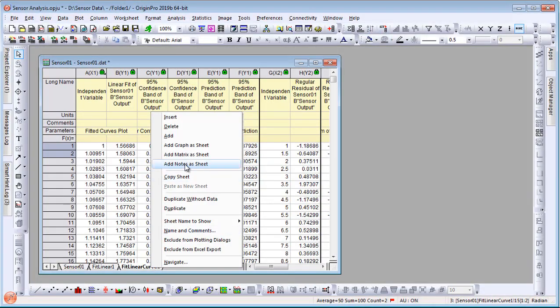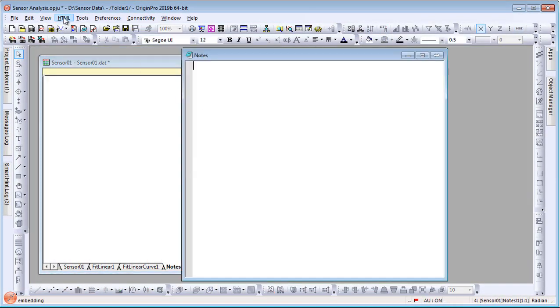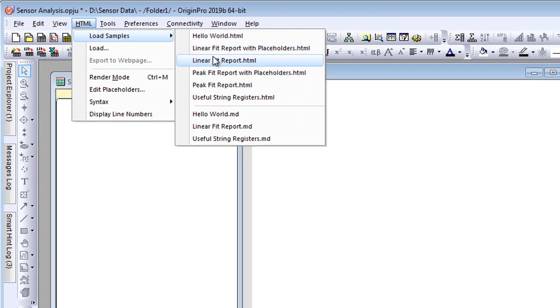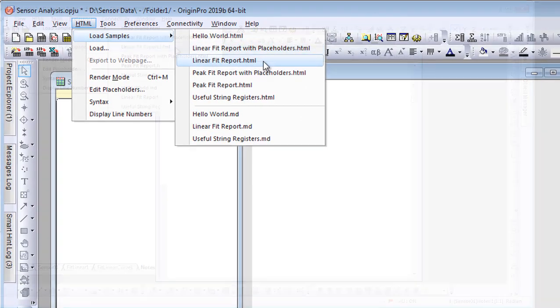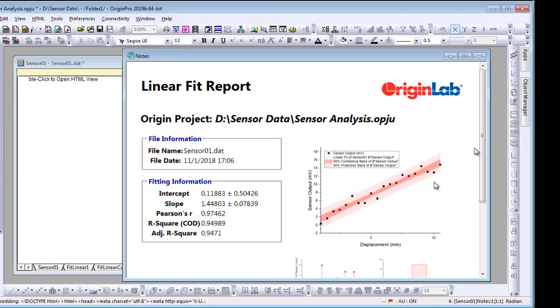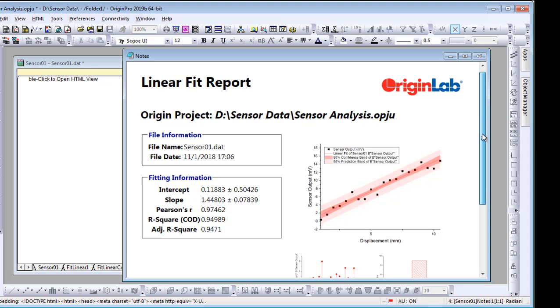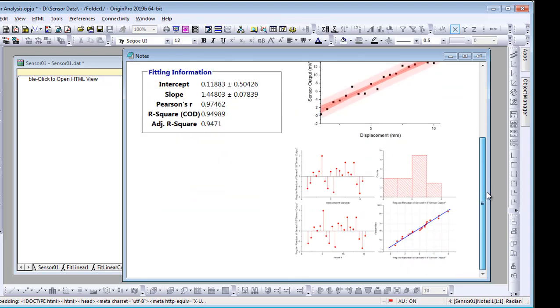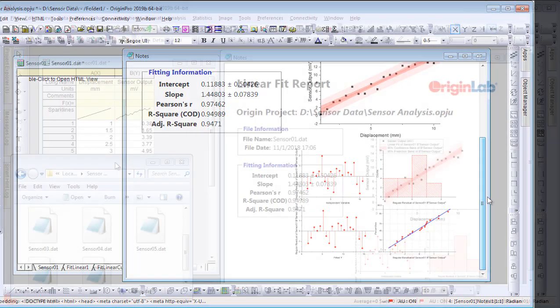Build a custom report using HTML or markdown syntax in a separate notes window. Add desired graphs and tables and a company logo, and you have a report that is ready to share.